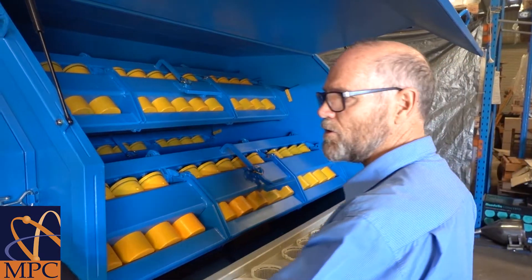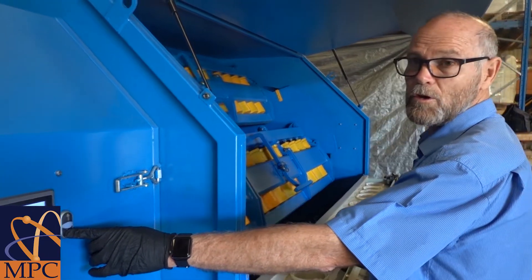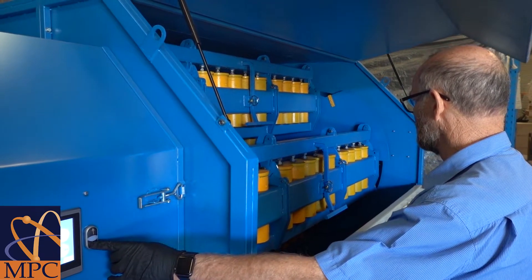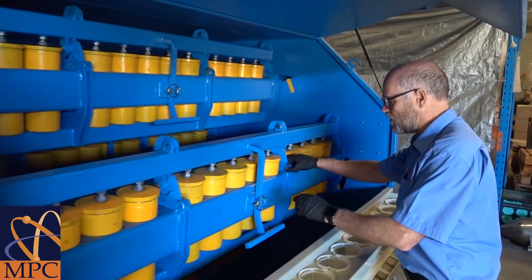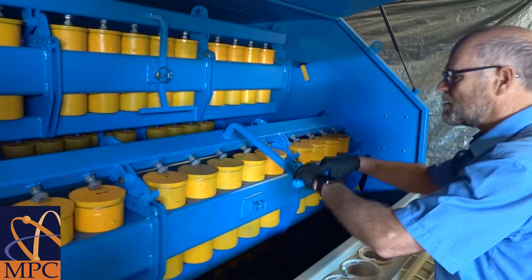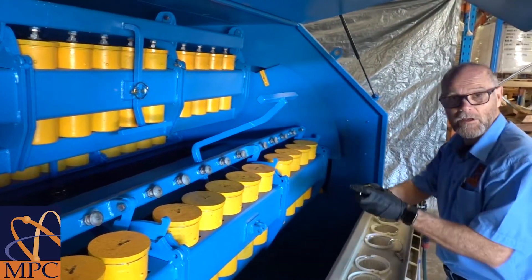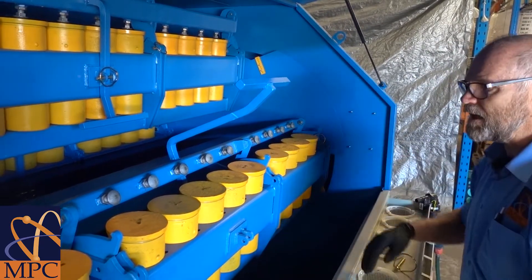We then use the tilt button to jog or move the arms into the vertical position, then remove the locking pins to open the arm to allow access to the pots. We then place one of the pins in the end to stop the arm falling down.